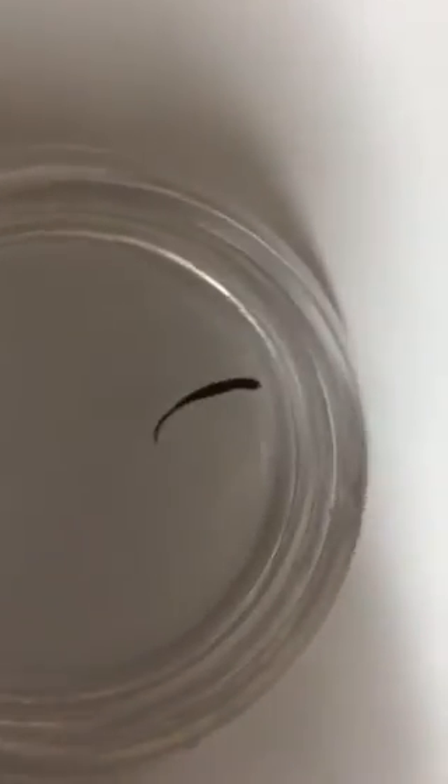Now I need to shine a light on the planaria. We need to shine a light on the planaria. Not really reacting. He might be going away from it. Certainly not going towards it.